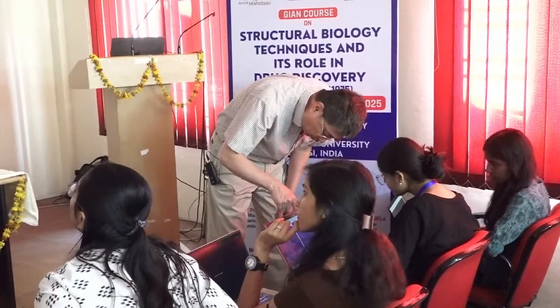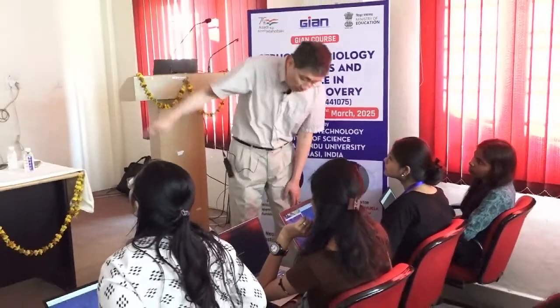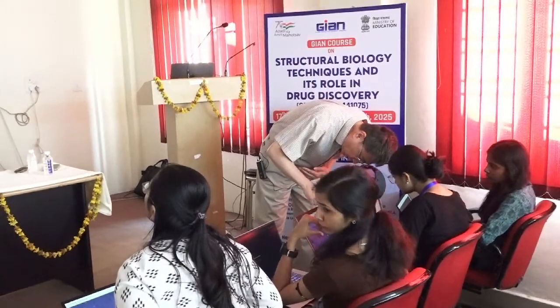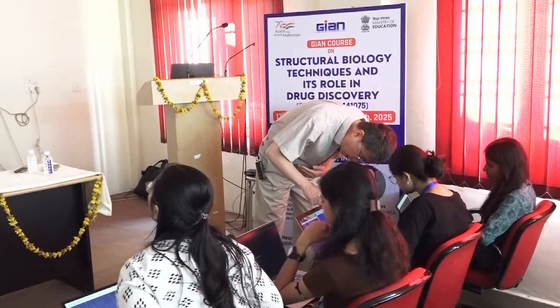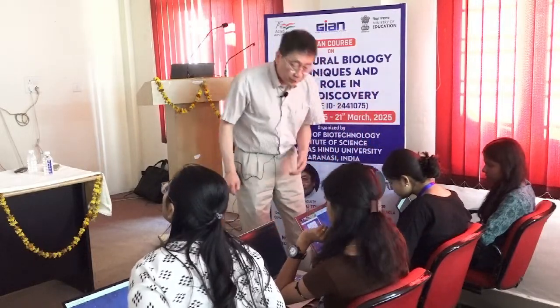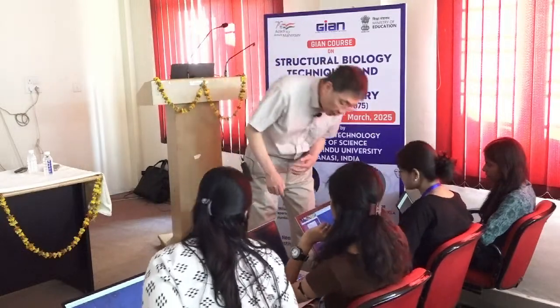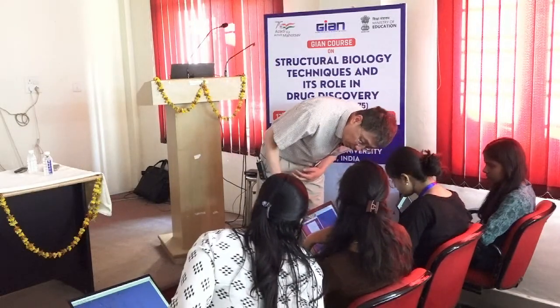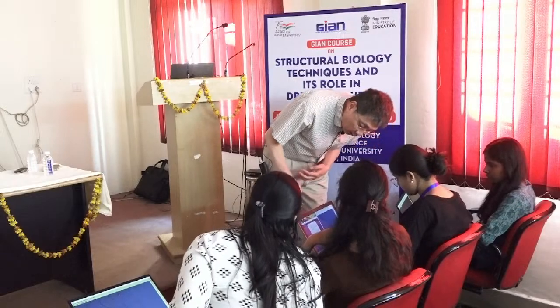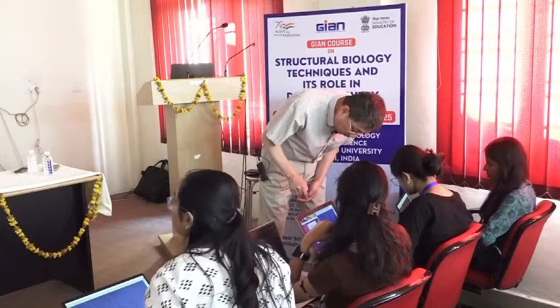Okay, so why don't you go to the arrow up here, the toolbar, this thing, the green one. Yeah. Click on that. Go to residue 2. Select residue 2. Residue number, yeah. You can put the number 2 here. 2. Yeah. And then say accept. There you go. You should be there.